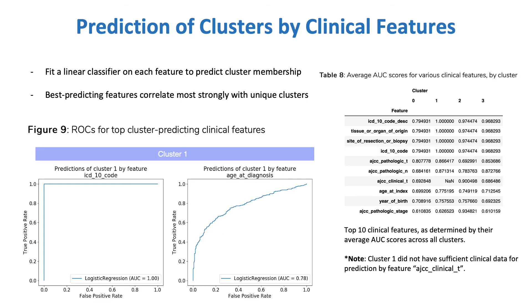Next, I fit a linear classifier on each feature to score how well it is able to predict a patient's cluster membership. On the left, you can see two ROC curves for well-predicting clinical features. ICD-10 code description, for instance, perfectly distinguishes whether a patient belongs to cluster one or not, while age on the right performs well but slightly worse.